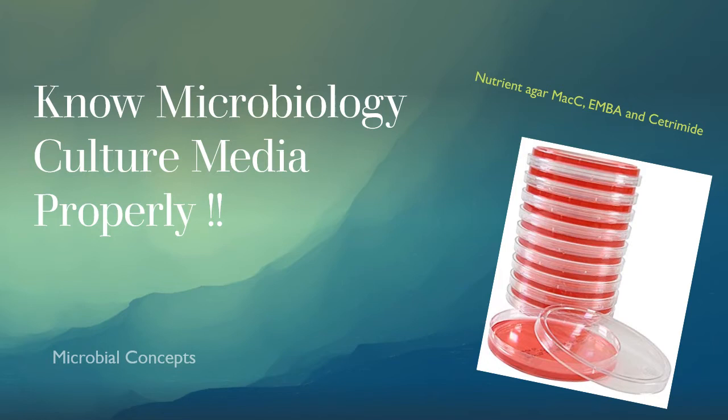So in this video we are going to cover nutrient agar, MacConkey's agar, EMB agar, and Cetrimide agar. This is part 1, and in part 2 we will be discussing Sabouraud dextrose agar, Mueller-Hinton agar, XLD agar, blood agar, and mannitol salt agar. I will be uploading that soon, so do watch part 2 also.